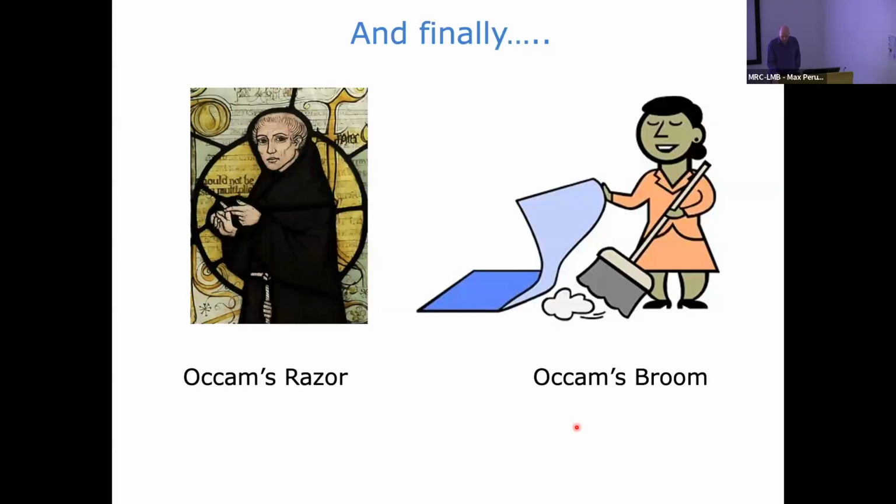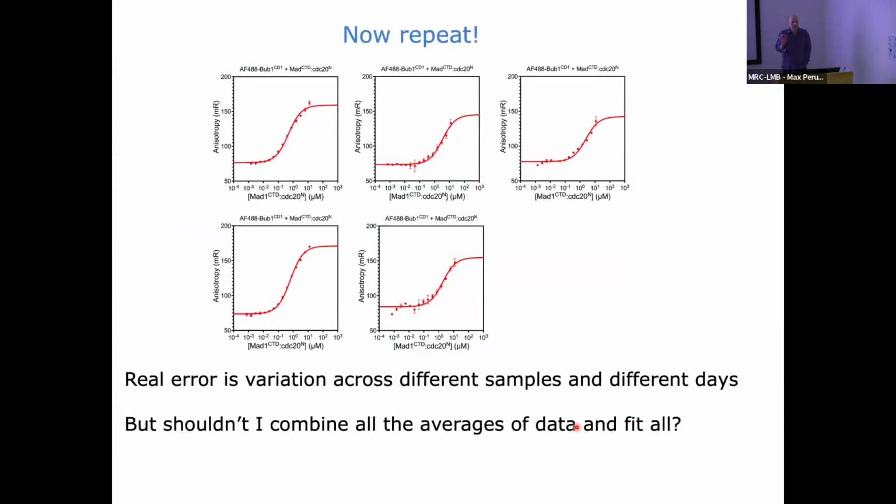If I go back, this is a case in point. Within each of these graphs there's a triplicate, so we've measured the signal 3 times, and then it's done on different days and different preps. So you might get natural variation, and that could be that your protein isn't as stable as you think. Maybe you're taking it from -80 and you're sure that it's the same, but maybe you've prepped it once, and done it again the next day. So an important thing would be to ensure initially how good is your protein or your other components. Does it go off, so that you're getting this variation over days? We've got lots of tools to look at that. How stable is your protein in the buffer system that you've got? Is there something better to do?